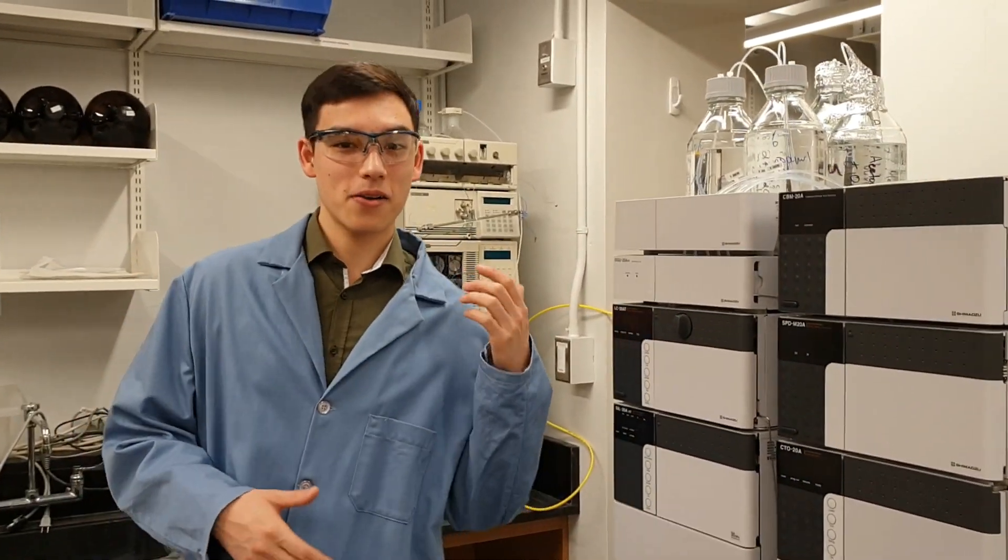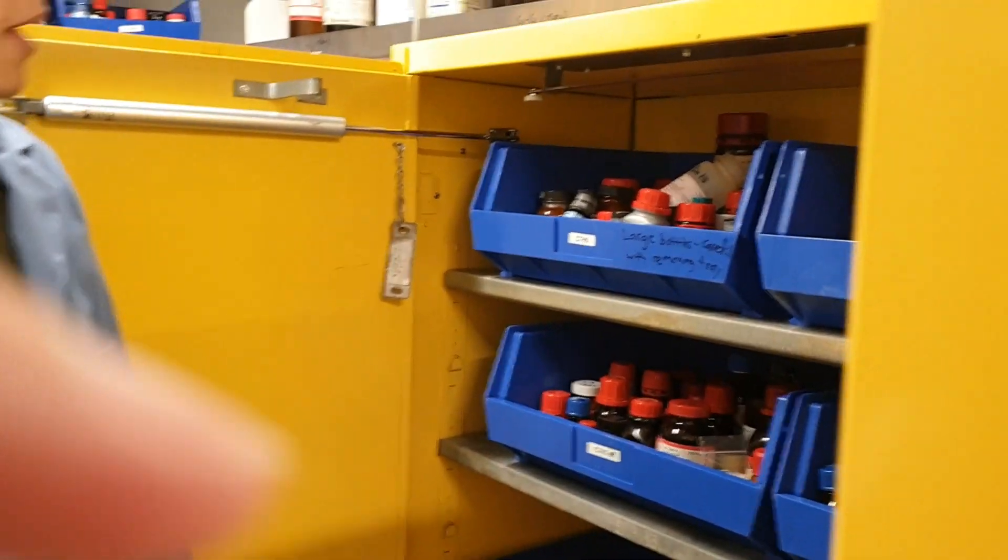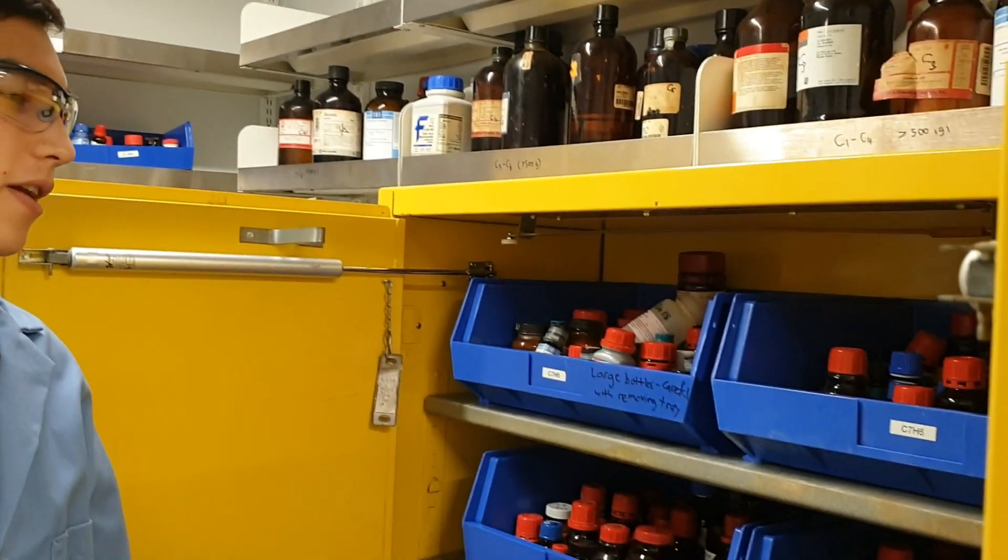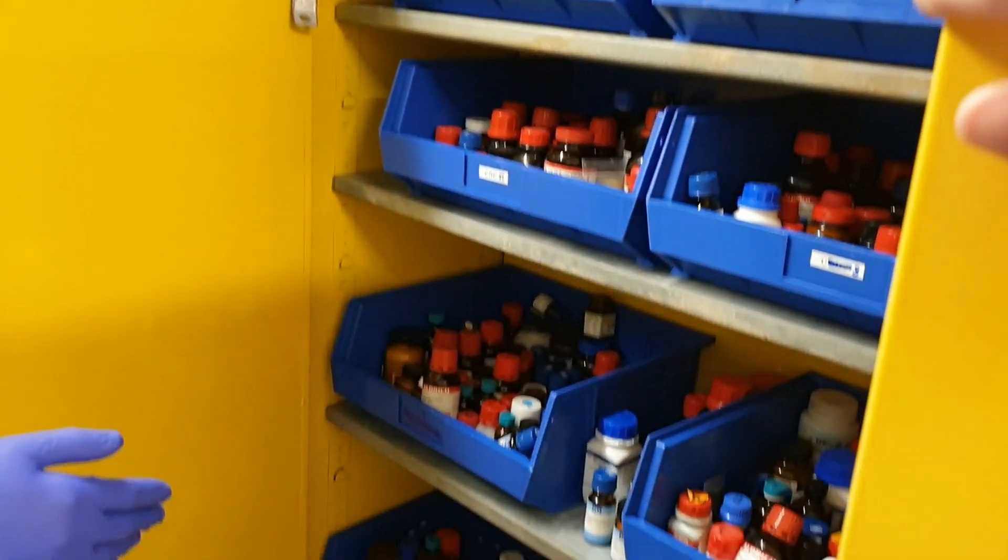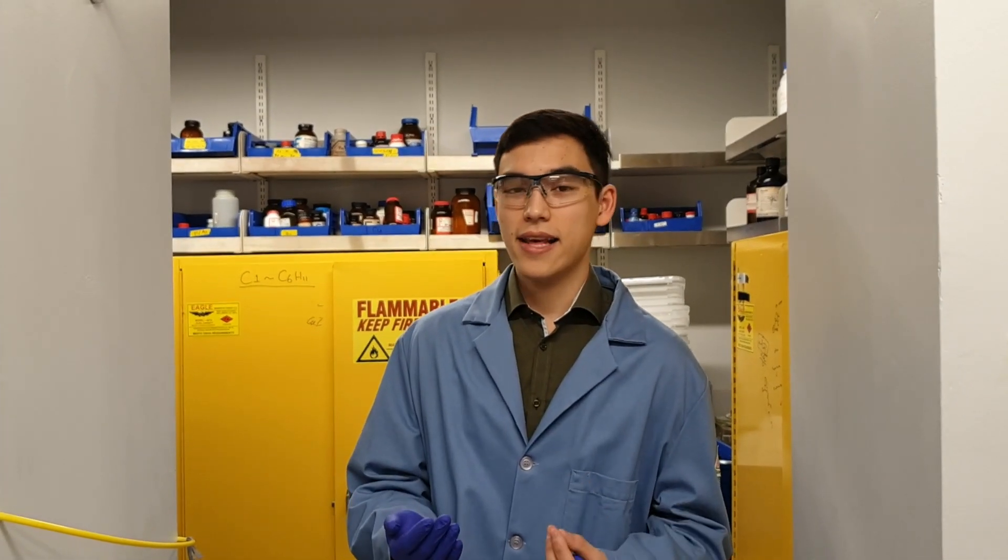Let's take a look at our current chemicals. We have a really extensive library of a lot of different compounds which you might use in your own synthesis. But whenever you need, you will also be able to order any commercial chemicals, basically, you can find. Our chemical system is ordered by carbon number, and as you see, we have a huge library of different compounds. What I really like about the Cornell Chemistry Department is that we have an interconnected system of chemicals. We have a little software where you can find your chemicals online, just by CAS number, and then look if anybody in the department has it. If anybody in the department has it, you can just go and borrow the chemical, and just like that, you have your chemicals immediately, and you can start your experiments right away.